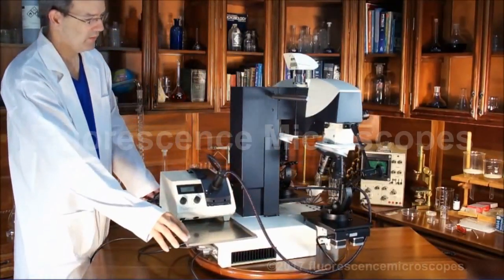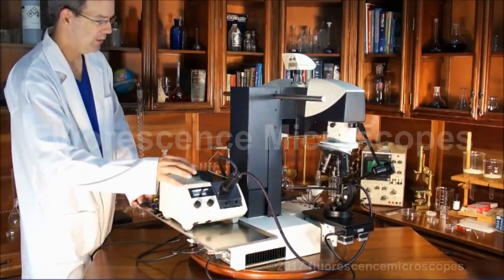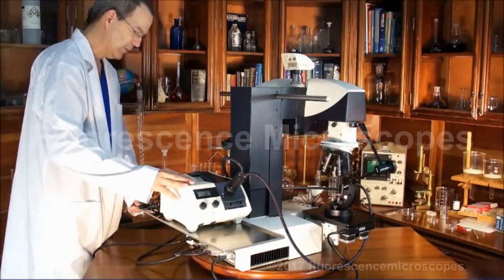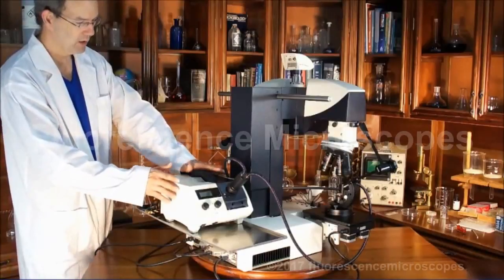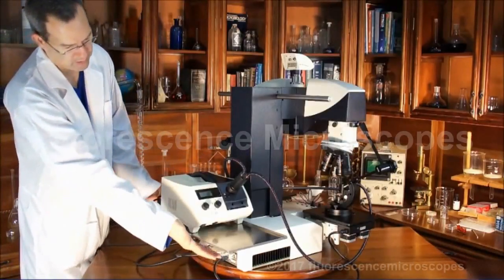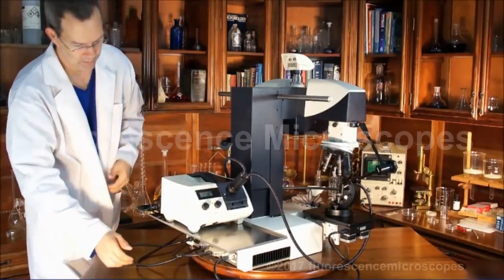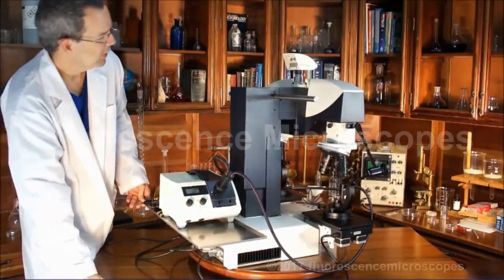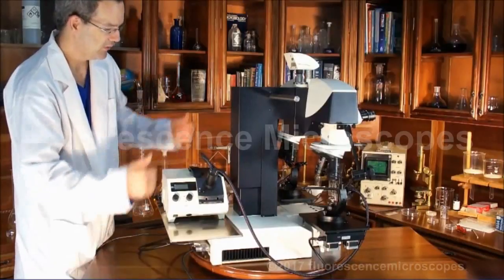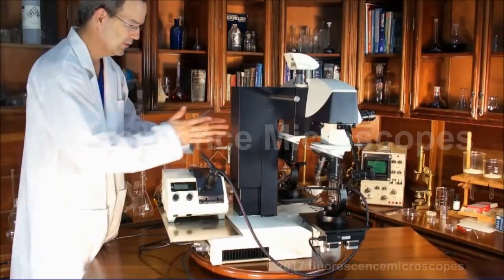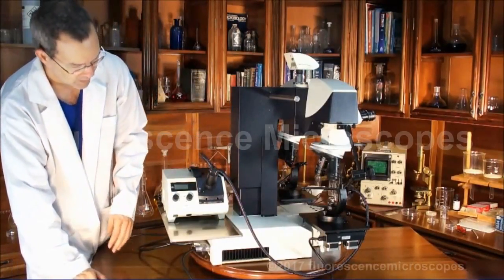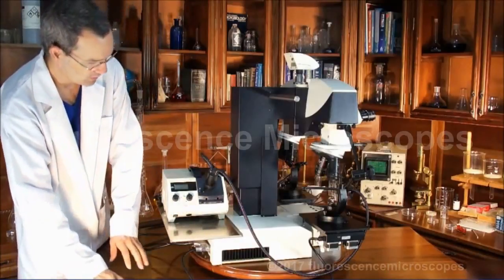This is a nice, convenient tray. You can take the tray to hold the fiber optic light source. This could be moved off to the side if you want. Take the tray off. Then you don't have as much depth on your table. If you're short of space this direction, I would do that. I'd take this off to the side. You could also put specimens if you wanted back here.